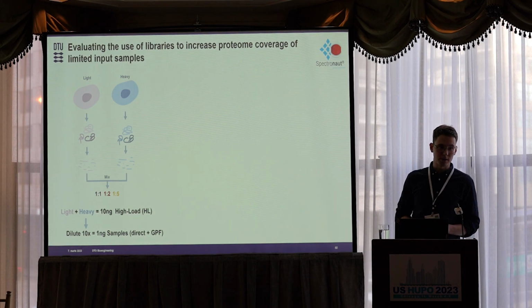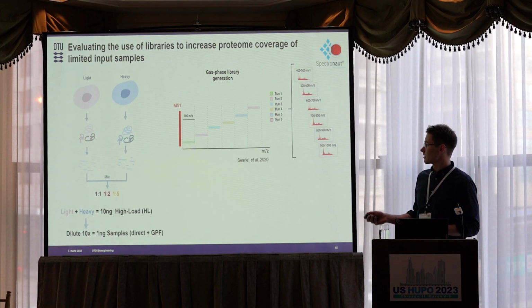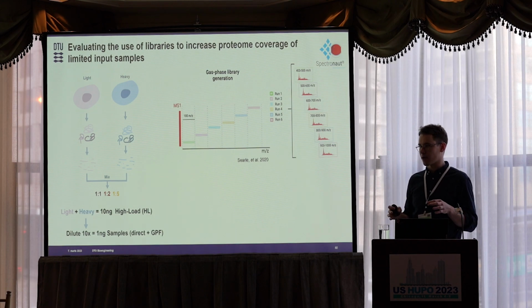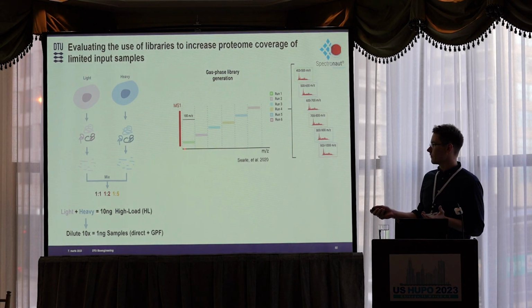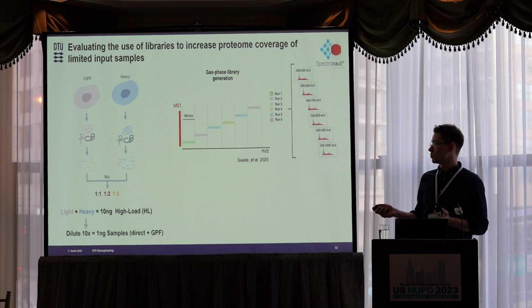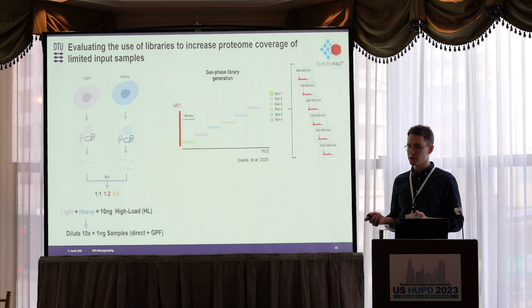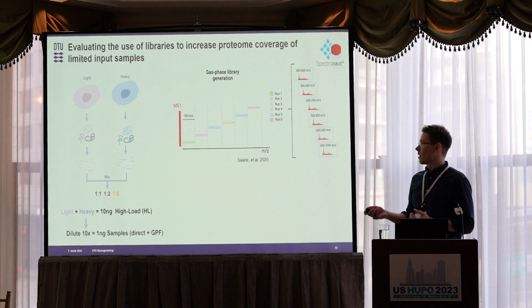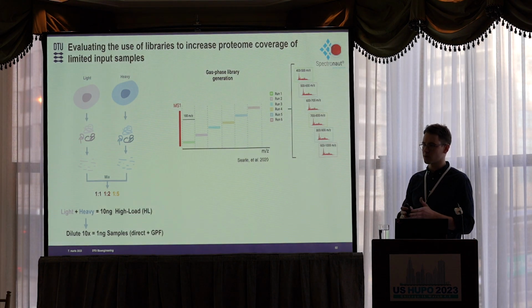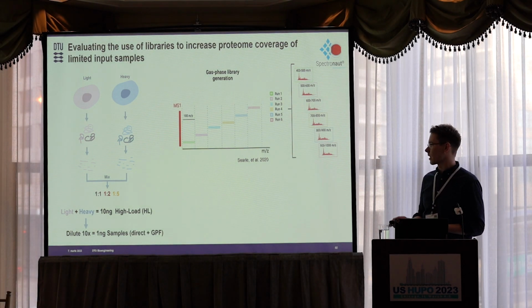And you might be wondering, what is a gas phase fractionated library? This is an approach that has been developed by Brian Searle, and I think it's a really elegant way to do fractionation on samples when you're not allowed or don't have the capacity to do a fractionation. So instead of looking at your whole m/z range of interest in one run, you split it into 6. For example, if you're interested in 600, you do 6 injections only looking at 100 m/z, and you just rerun the same sample 6 times. That means you can spend 6 times the time on your MS2s and MS1, have narrower isolation windows, and have more time to actually do the data acquisition. So you can have more proteome depth when constructing a library like this.